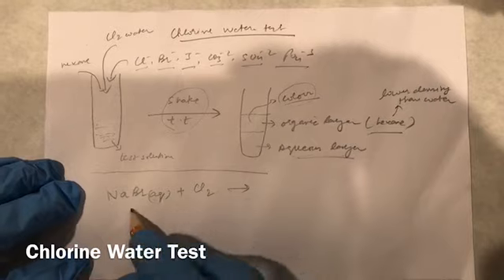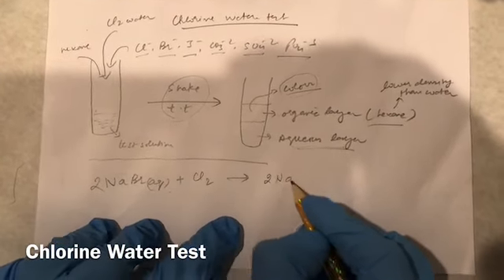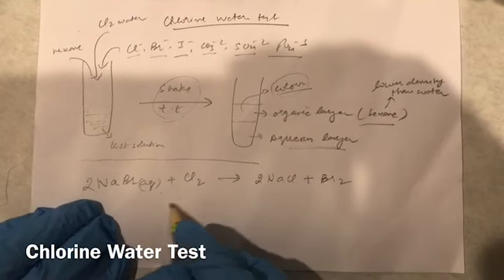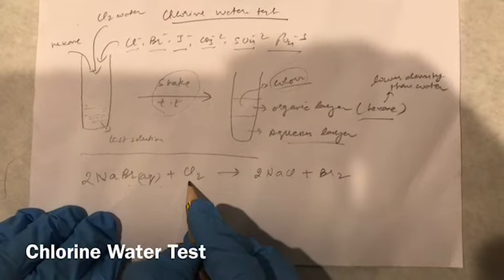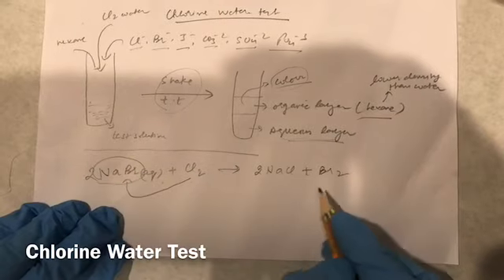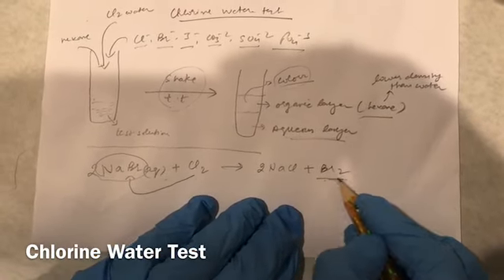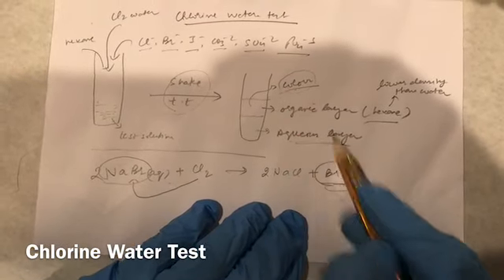So now this is a single displacement reaction. If you balance it, you would get 2NaCl plus Br2. Chlorine is more reactive than bromine, so chlorine can displace bromine from the solution, and bromine will dissolve in hexane, and that's the color you would see in the hexane layer due to the bromine.